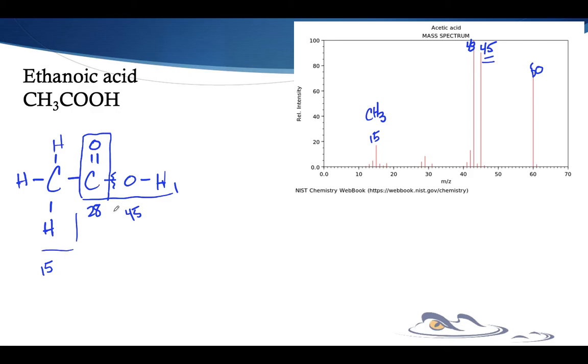And do they have the masses that I'm looking for? That's how we work with mass spectra: we try to sort them out based upon the structures and the possibilities of structures and look at the peaks and see if they match up to it.